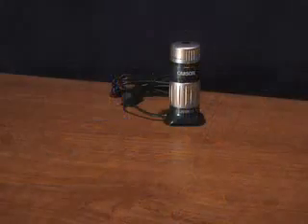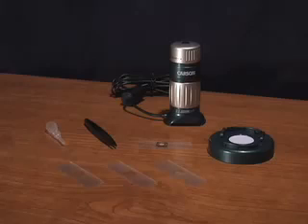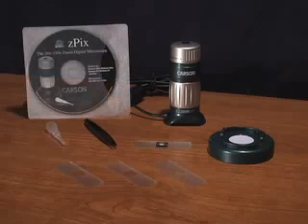Both models come with a digital microscope, a specimen base, forceps, an eyedropper, three blank slides, one prepared slide, and a CD-ROM software.